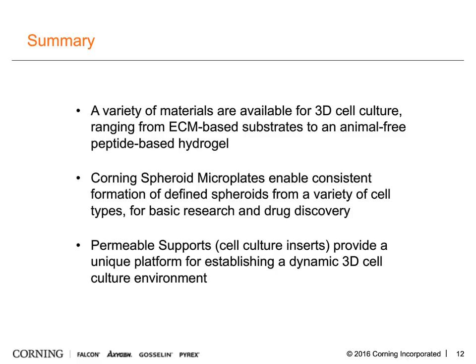environment. Today, you will hear two talks that demonstrate the utility of 3D cell culture, one using tumor spheroids to more accurately screen for anti-cancer compounds, and the second focusing on the generation and analysis of gut organoids in the context of diet and cancer.